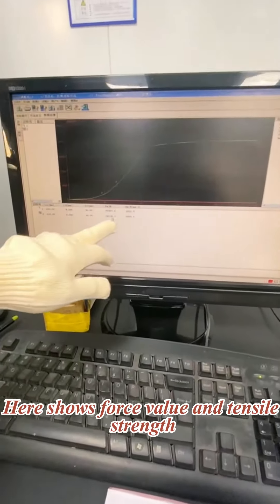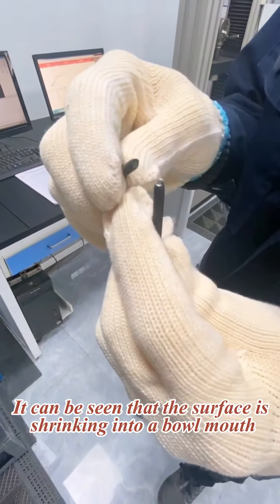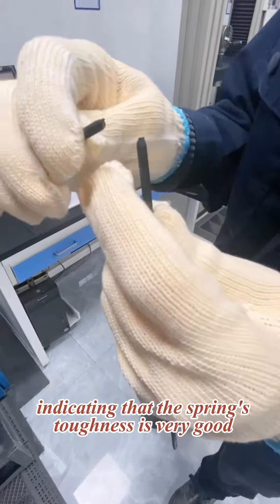Here shows the force value and tensile strength. Finally, analyze the surface shrinkage from the fracture. It can be seen that the surface is shrinking into a bowl mouth, indicating that the spring's toughness is very good.